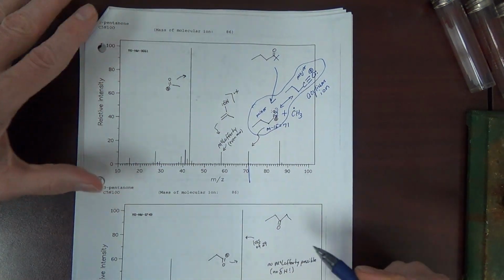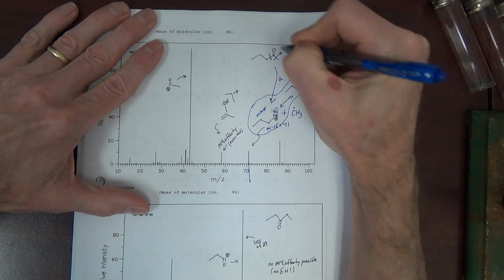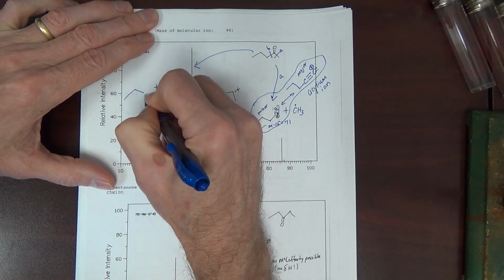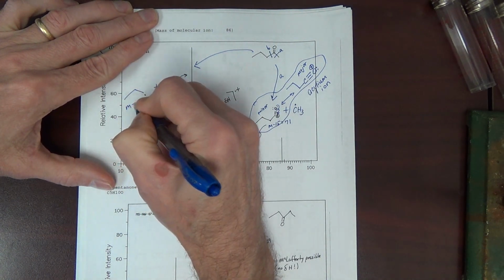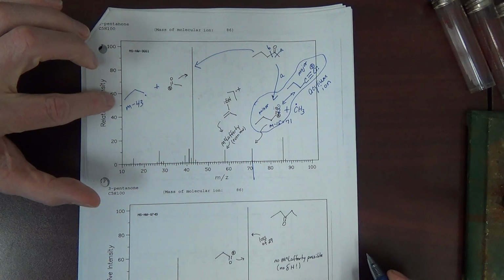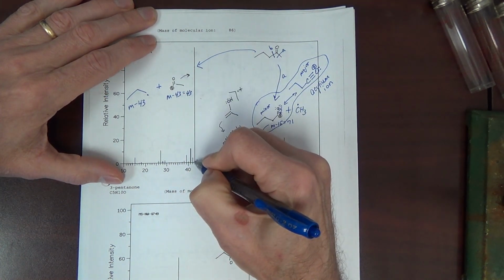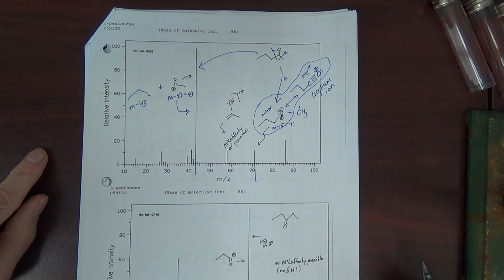Now, there's another way to get an acylium ion here. We could cleave on the other side, call that A. We can also do a B cleavage. That would put the cation here, another acylium, plus that radical, a 3-carbon radical. Now this is pretty big, but that is 43. 3 carbons is 36, and 7, 43, yes. So this is M minus 43, which equals 43. And indeed we have a peak at 43, which is for this acylium ion. Two different acylium ions could be formed here.